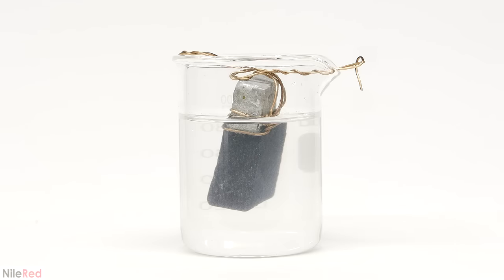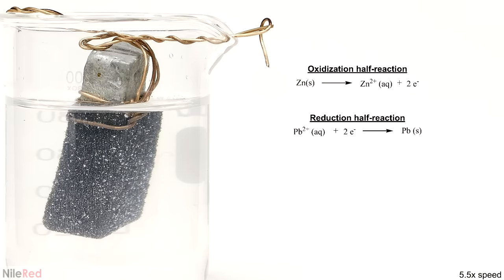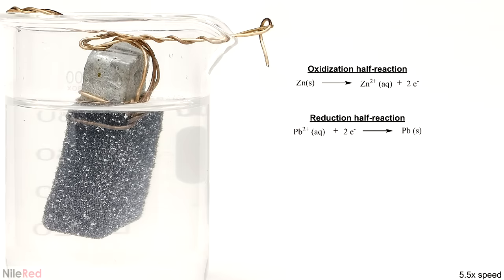The moment the zinc is added, the lead immediately starts forming on it. It's initially black because the particles are small, but very quickly some larger shiny lead crystals start to form. What's going on here is a redox reaction between the zinc and lead, where the zinc is being oxidized and the lead is being reduced. The zinc metal is giving up two electrons to form zinc ions, and the lead ions are picking them up to make lead metal. The zinc ions dissolve into the water as they form, and the lead metal slowly grows as crystals.